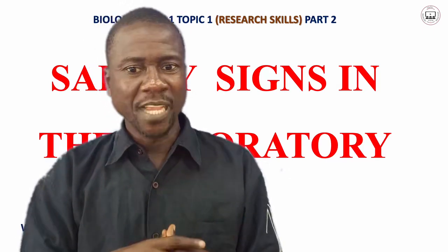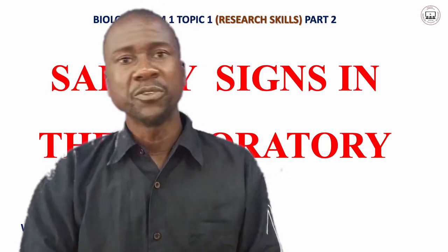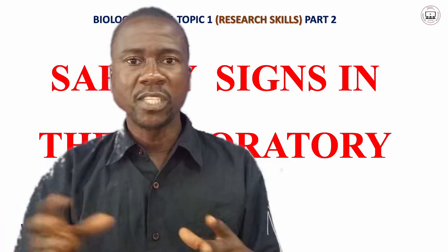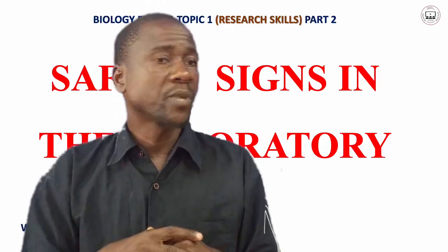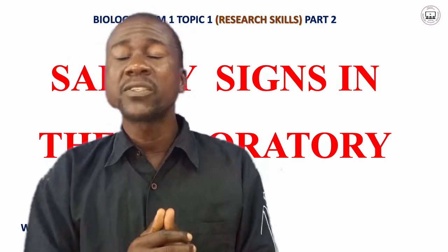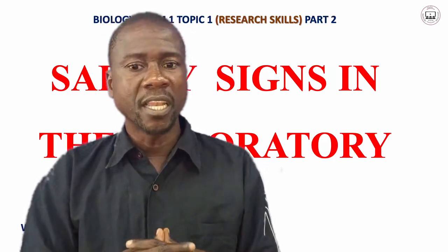Remember, the last time we discussed research skills, that was regarded as part one, whereby we were introduced to the term biology, and then we discussed the importance of studying biology. We further discussed how you may handle glasswares in the laboratory, how you may handle specimens, and how you may handle heatings when you are doing heatings in the laboratory.